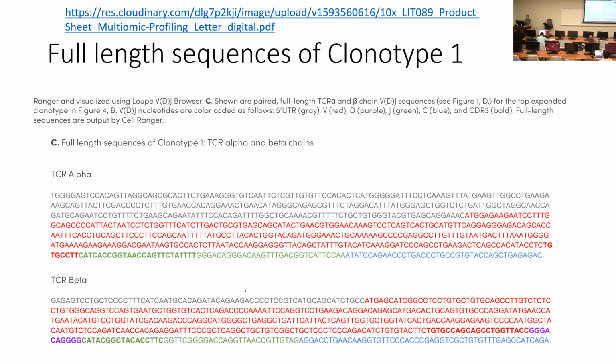If you really want to look at what's inside, you can track down the full length sequence of clonal type 1, for example. You can look at the sequence. Indeed, you found this particular consensus, and you know it gave the subtype of this. So for this particular clonal type, you also have its beta unit looking like this, so you know its VDJ combinations, what type.